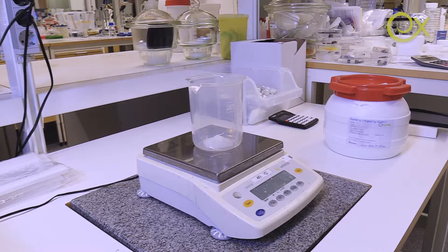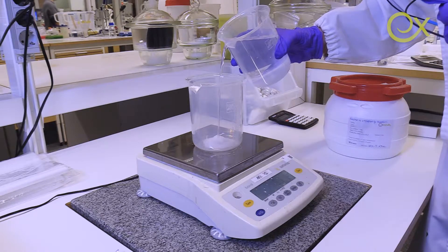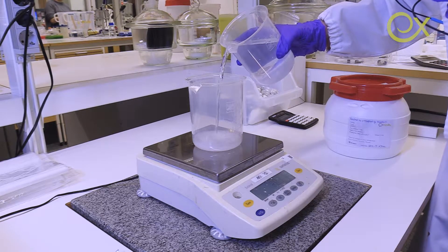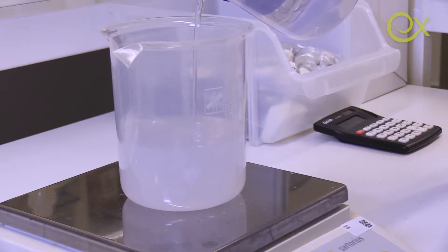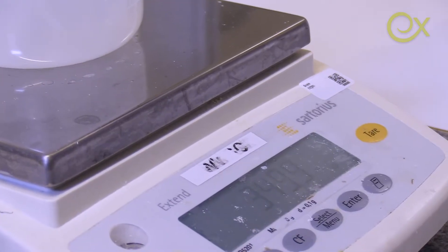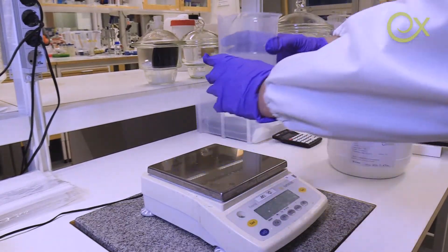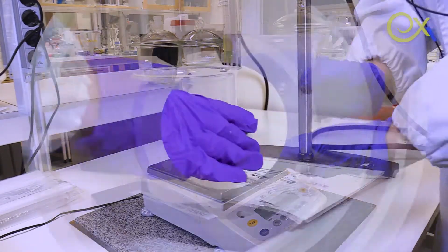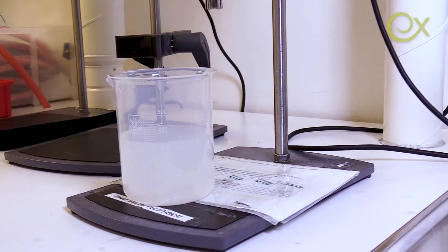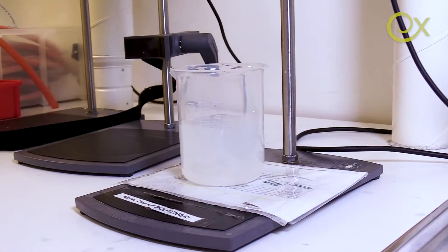Now we need to dilute it to 350 grams of water. The second step is to do mixing of our suspension, and for that reason we are going to use the Ultra Torx equipment.